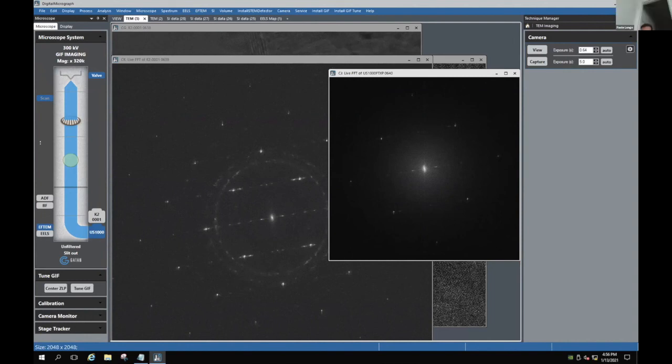Oh, I just got a question from Dave. Any comment on cryo holder developments for atomic EELS? So we have the EELS holder, the 698. That is a single tilt at the moment, but we're working on that. It is actually pretty stable. If you look at the results we're getting in terms of drift, it's pretty stable.